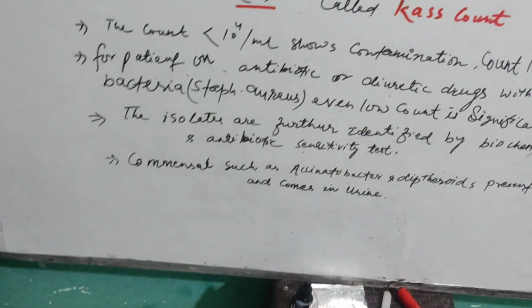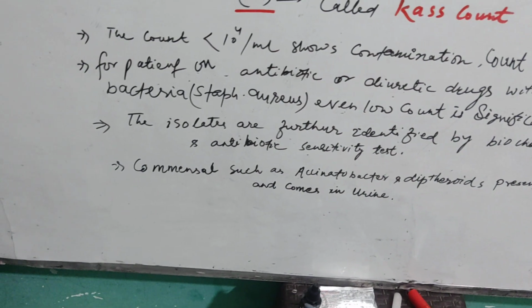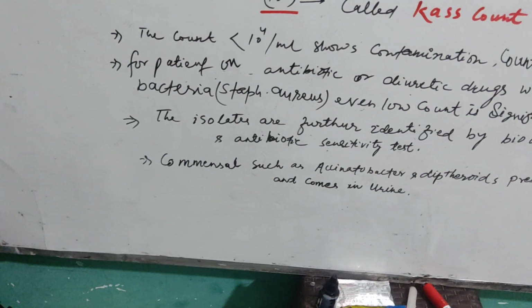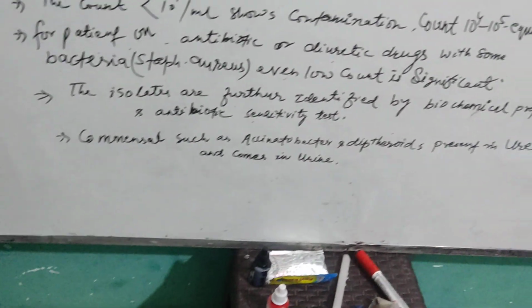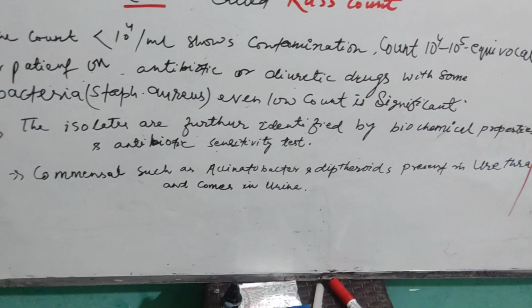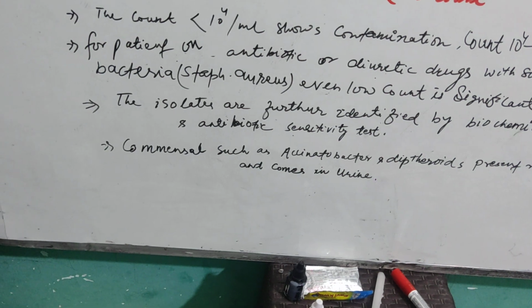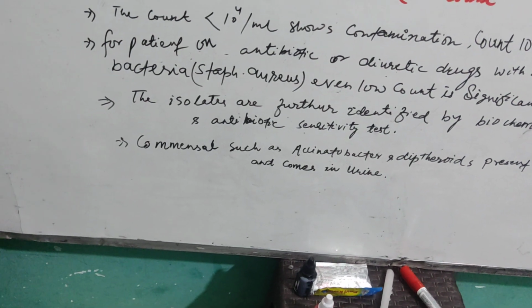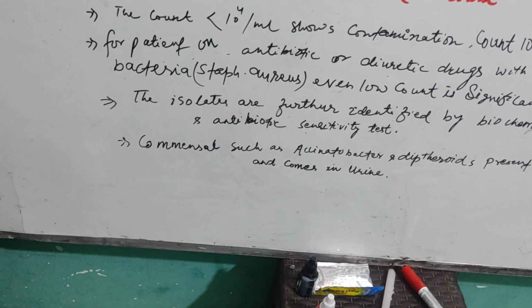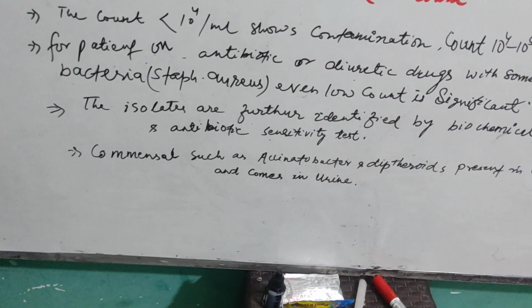The isolates obtained from this media are further identified by biochemical properties and the antibiotic sensitivity test. So further they are identified as to which type of bacteria this is. These are tested by the biochemical properties and the antibiotic sensitivity test.